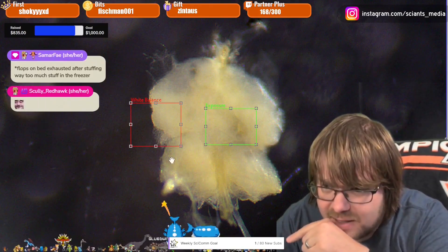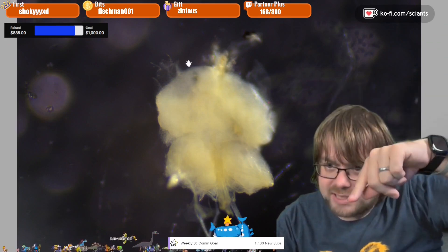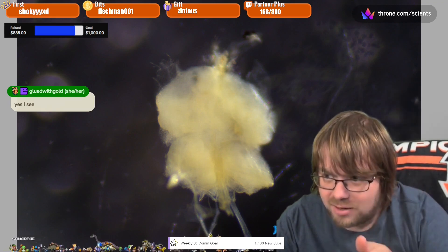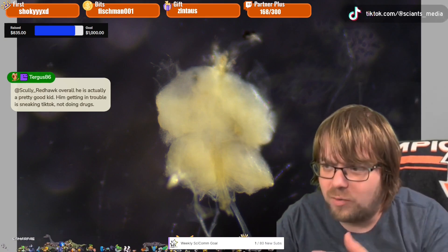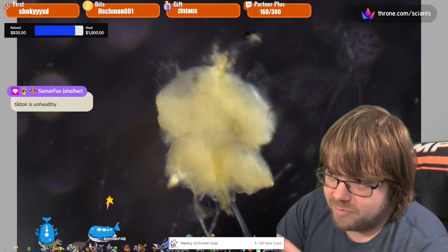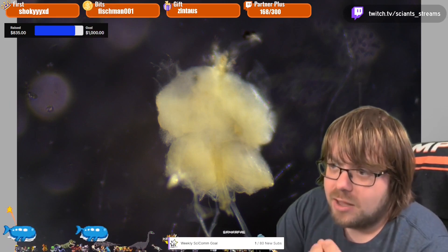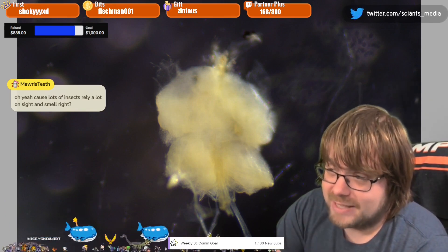Now with it right side up I can show you the antenna lobes - do you see those two circles? It's almost symmetrical. I've aligned it so this is the top of the head, the bottom is where the mouth is, and these are the antenna lobes where the antennae connect. If you cut right down the center it's a mirror image on either side, which I think is really cool. Also, some specimens were already dead before they were put in the vial, meaning they had started to degrade before preservation, so some heads may fall apart rapidly when opened - not because of bad dissection technique, but prior decay.